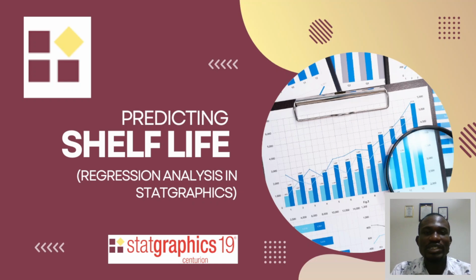And I'm choosing this software, Statgraphics, carefully because Statgraphics is an application that gives you that stability study tool as part of its analysis. With the other applications, you have to use regression analysis and find the model that gives you the best R squared. We'll go more into that.